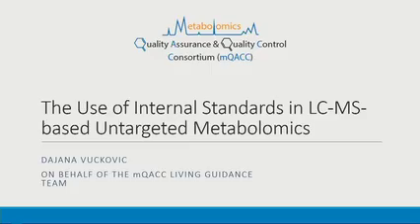In terms of the guidance, we don't want to mandate one way or the other. The idea is you select what's best for your study, but also keeping in mind what you want to control, right? If you want to control your sample preparation with the pooled QC as well, then you need to do it pre-extraction. If you only want to control your technical performance of the LCMS instrument itself, then you can pool post-extraction. So we want to keep this open to different types of studies, different types of samples that we have.